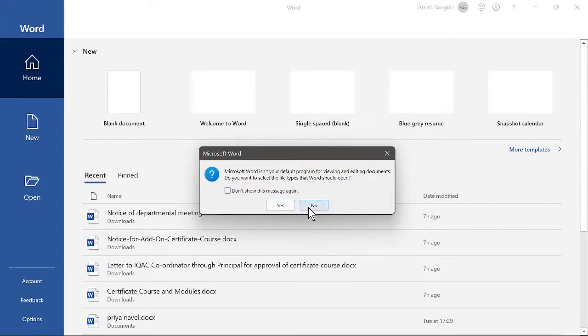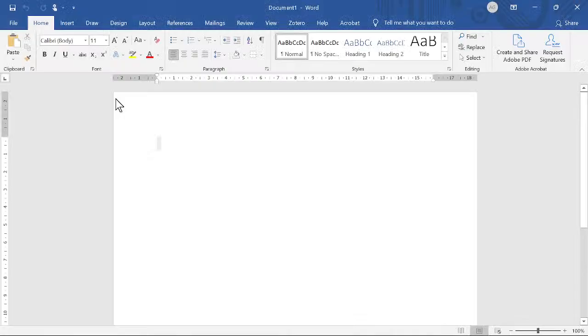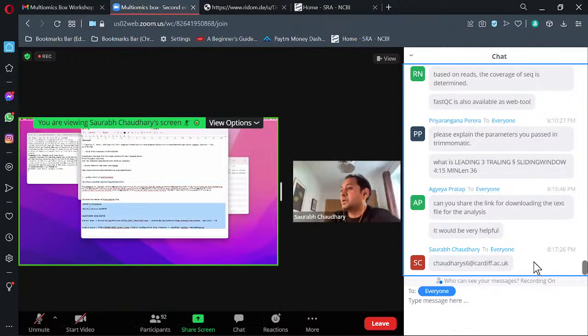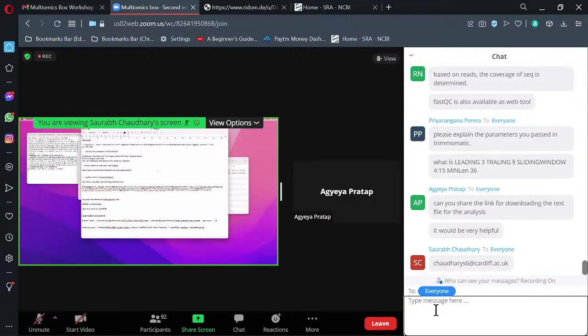Okay, can you see this text file? Yes, definitely, I can see that. Okay, I will give you this file. It will give you the steps. You have to perform quality check with FastQC. From where do you download FastQC? Then Trimmomatic. And then after Trimmomatic, you have to perform Salmon quantification. Okay, and then we have the data. Yes. Thank you so much.